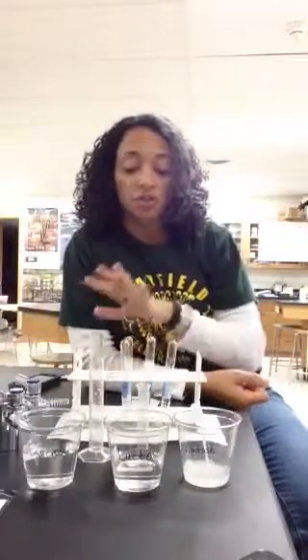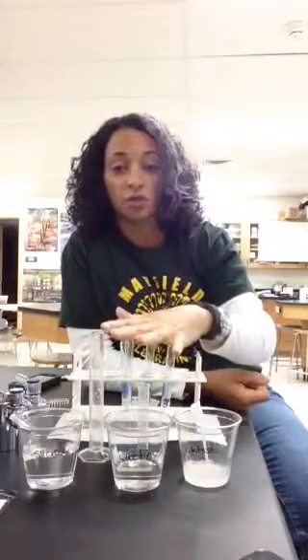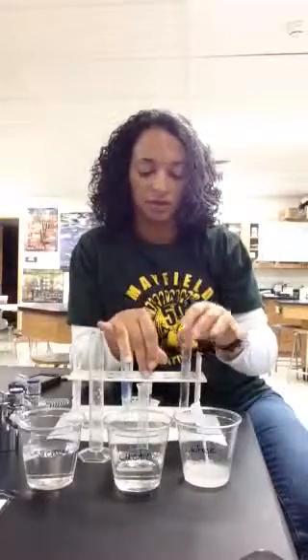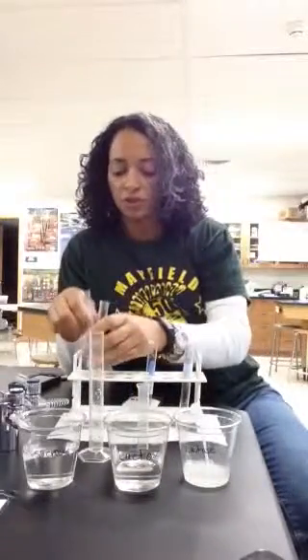First thing you need to do is rinse out your test tubes and your graduated cylinders. This is just to make sure that whoever did this lab before you, in case they didn't clean up, you don't want any cross-contamination issues. So I've rinsed my test tubes out already, so I'm going to go ahead and turn these over into my test tube holder. The first sugar we are going to be testing is lactose.